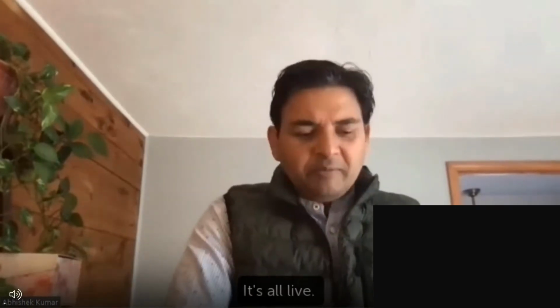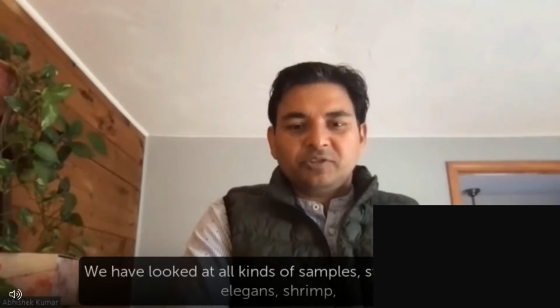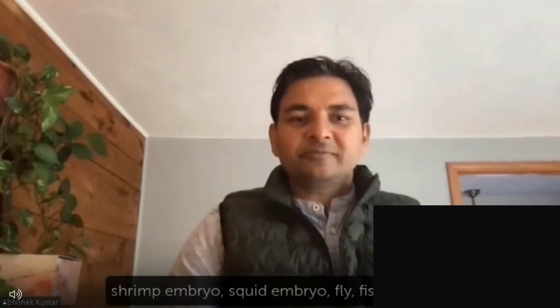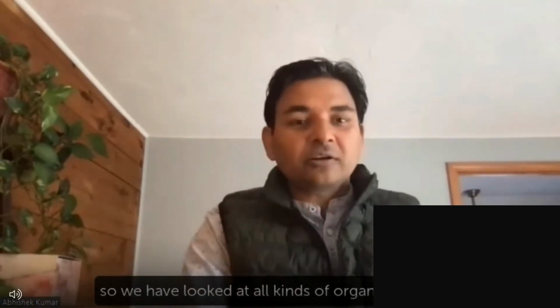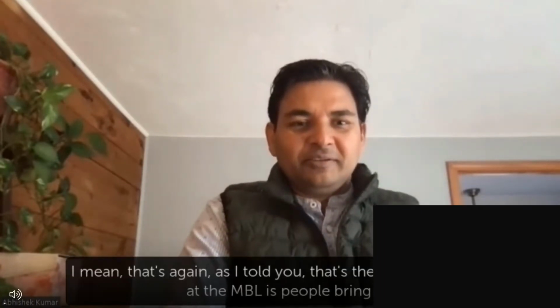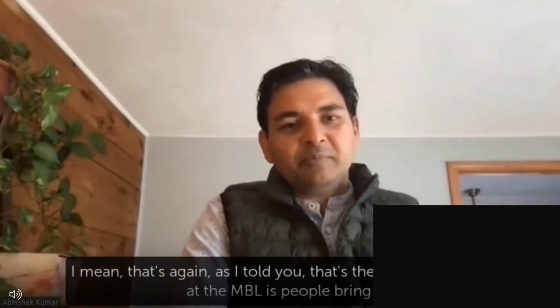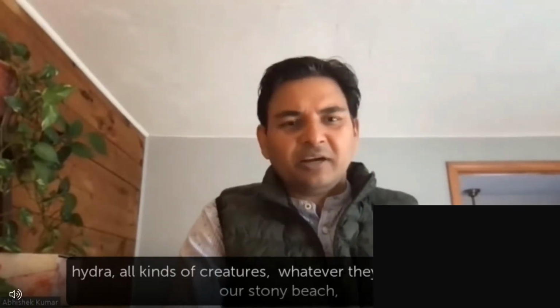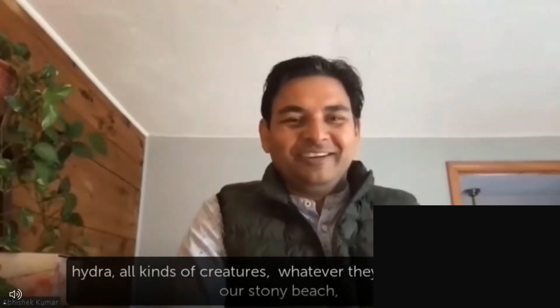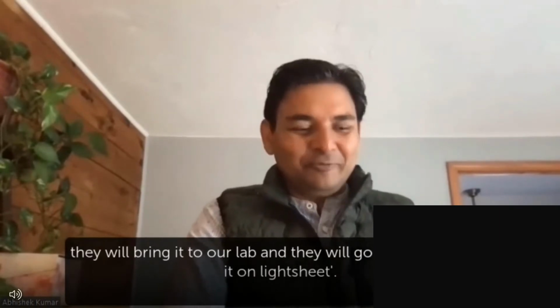It's all live. We have looked at all kinds of organisms, starting from C. elegans, shrimp embryo, squid embryo, fly, fish, axolotl. So we have looked at all kinds of organisms. That's, as I told you, the benefit of being at the MBL: people bring hydra, all kinds of creatures. Whatever they can capture on our Stony Beach, they will bring it to our lab and say, okay, can we image on a light sheet?